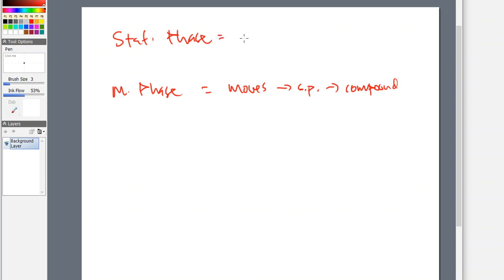The stationary phase is something that's kind of stuck, and what we've been talking about here is it's stuck inside of a column, but now it's stuck on the surface of a flat plate. So it's still there, it's not moving, hence the word stationary, and this is going to allow our molecules, or our sample components, to interact with the stationary phase that's on the surface of that plate. So it's still chromatography for that reason. We still have the same theory of mobile phase. We still have the same idea of a stationary phase that still goes on.